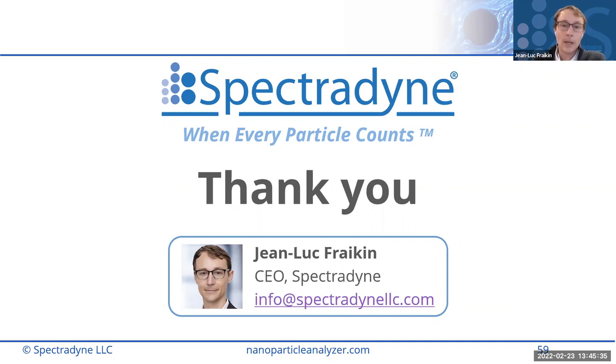Good question. So I'm definitely not an EM expert. The EM measurements that I showed were done by experts, and the data was provided to us. So it's my understanding, though, that cryo-EM kind of gets around that because you don't have to dehydrate the sample to measure it. So I think that's the relevant answer to the data that I showed there.